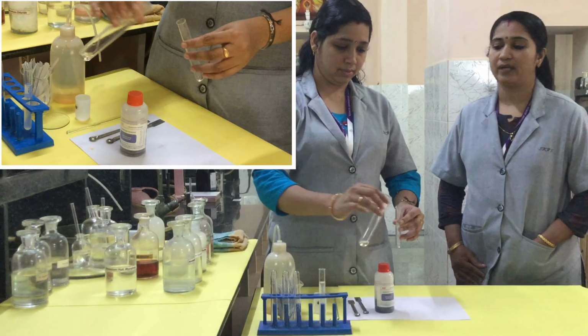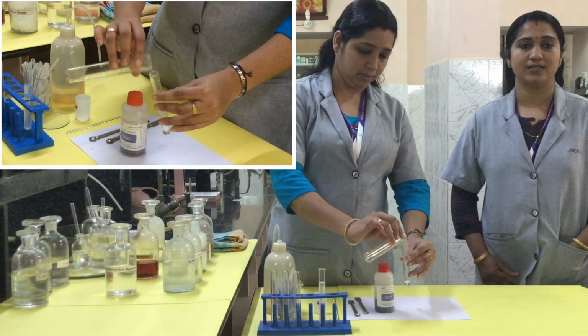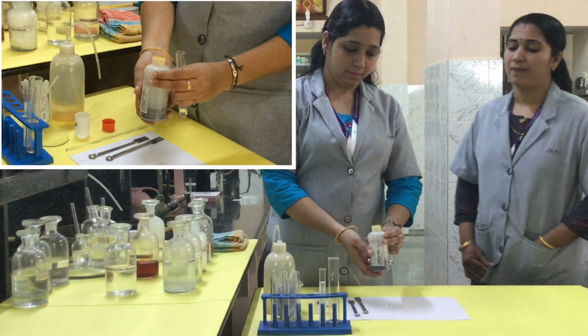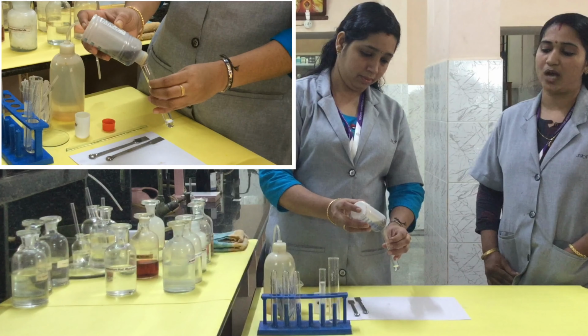The first test for magnesium is the Magneson reagent test. For that, we take the salt solution in a test tube and add 2 or 3 drops of Magneson reagent.